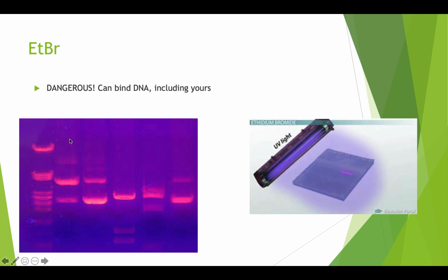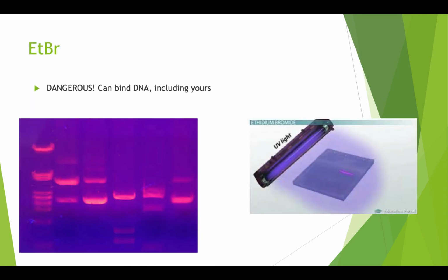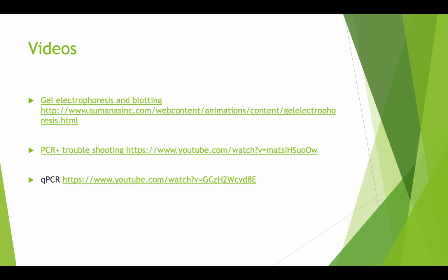Then in a special camera box you can take a picture of this, and you will come up with a gel image. Then you can analyze your gel. So it's very important. That's how gel electrophoresis works.